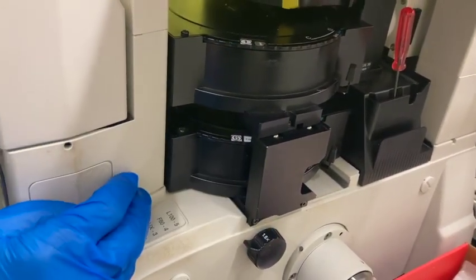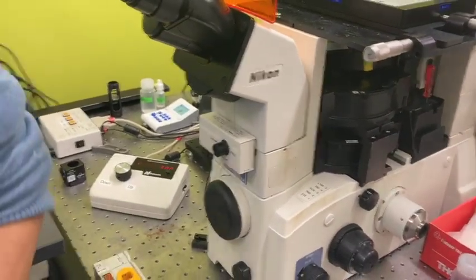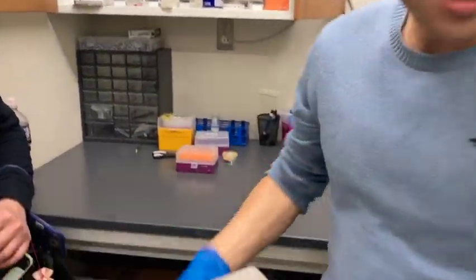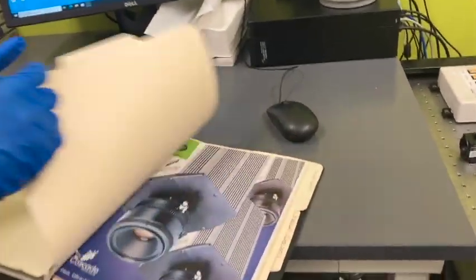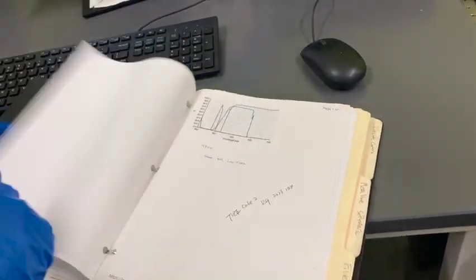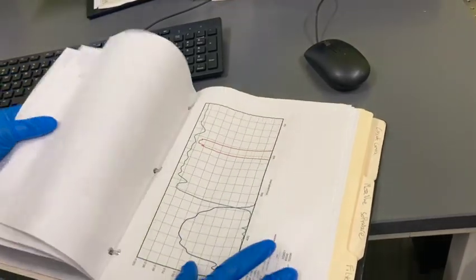So by definition, 2-light TIRF, I have it here. I should be prepared, but this is kind of manual, I mean, for all this microscope stuff. And then we have our 2-light TIRF somewhere around.